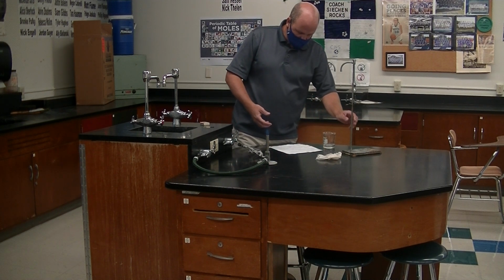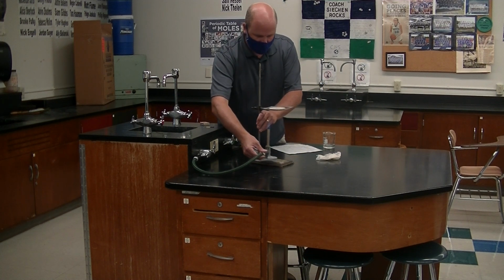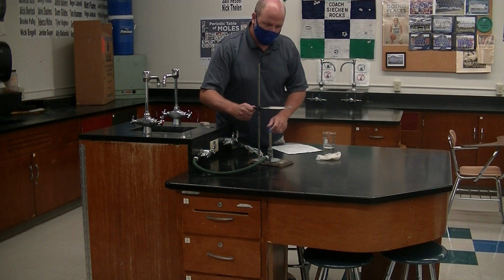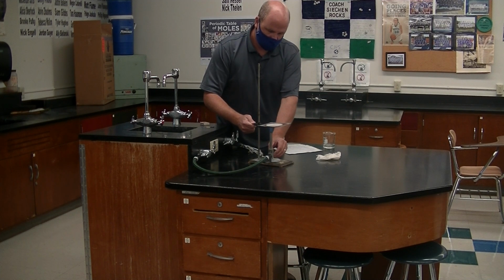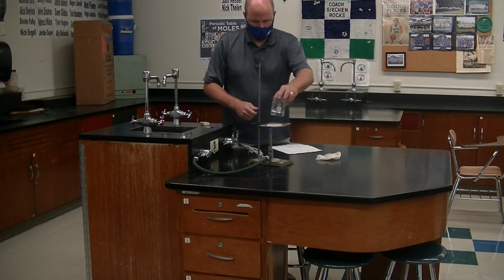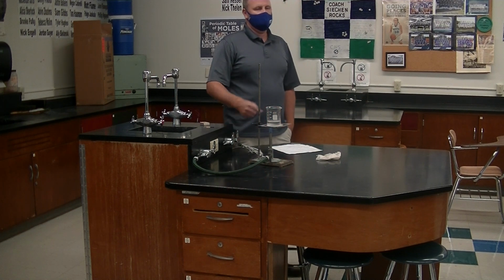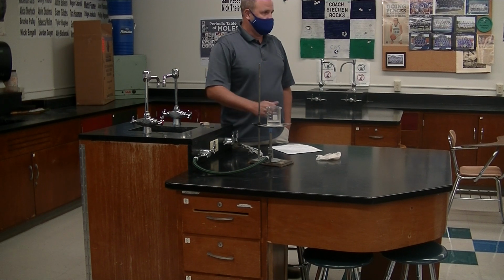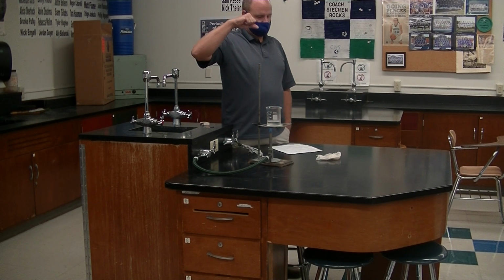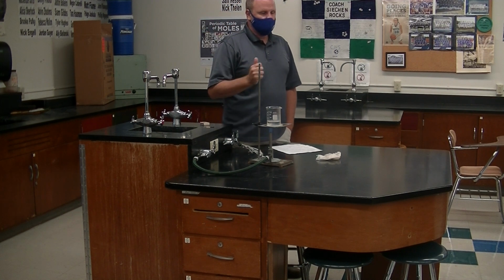We said heat's a problem when it's not expected. I will tell you, by and large, the majority of accidents in the lab happen in the last 10 minutes of class. Why? Because people are rushing to finish. Exactly. They want to get to lunch, they want to get to the next class, they want to do whatever. So rushing is a problem.